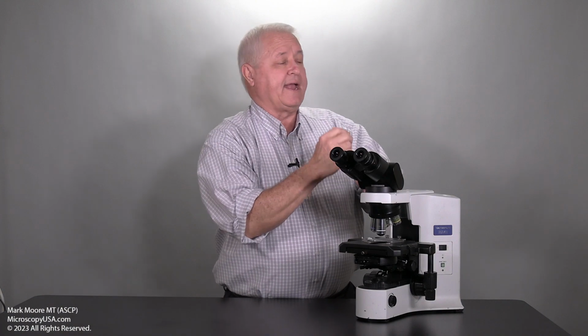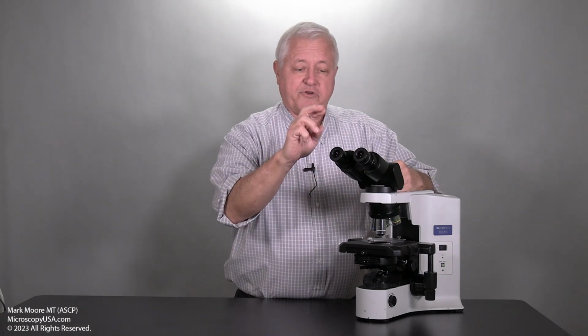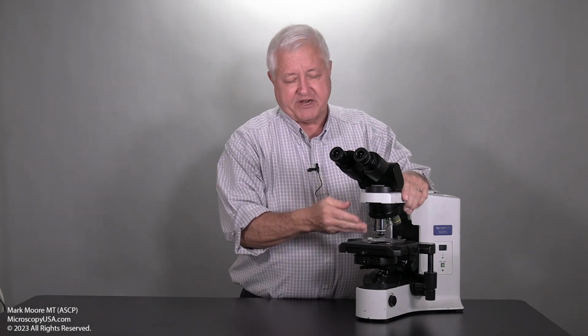If I have a projector running and an image on the wall, and I move the projector back, the image gets bigger on the wall, but there's no more detail in the image. It's just a blown up version of what you saw when the projector was closer. Same thing here. If you increase the magnification of the ocular, the cells are bigger looking through the microscope, but there's no more detail in the image. There's no more resolution. So the resolution is controlled by the objective, not by the ocular. And 1000x is really all you get in terms of resolution on the microscope.